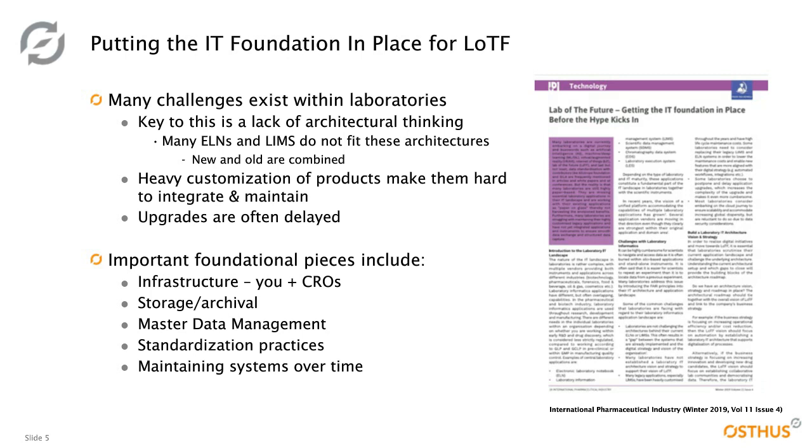So the important foundational pieces that we see that help to remedy this is, number one, you have to start by thinking about your infrastructure. And by your infrastructure nowadays, given the landscape of how pharma companies look from the business side, it's not only you, it's you and all of your partners. This might include a whole host of CROs that you work with that are handing you new compounds or their research material, and it's in an incompatible format, or they have a different ELN or a different LIMS system than you use. So now you have this problem multiplied. Not only do you have the problem inside of your labs and your company to integrate the data, you've got this problem of integrating across multiple people's sites.